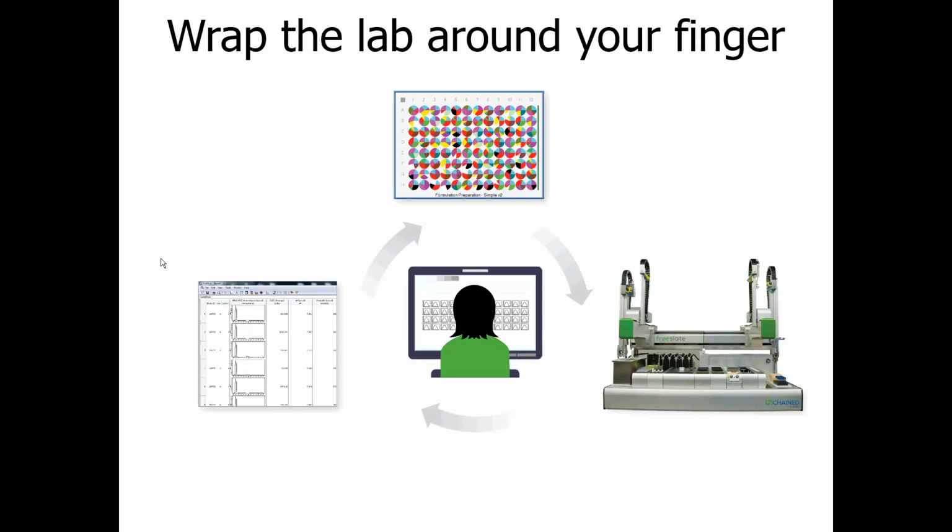For those of you who are not currently using a Freeslate instrument or do not currently have LEA, I wanted to briefly discuss what LEA is for. So LEA stands for Laboratory Execution and Analysis Software. And the intent behind LEA is pretty simple. There are a lot of experimental design issues that go into creating an experiment and doing that in a high throughput manner. When you do stuff in high throughput, you simply have a lot more data to analyze, and you need some way to pull it all together. So LEA was really designed to allow for a well-by-well analysis of information and tracking of that.